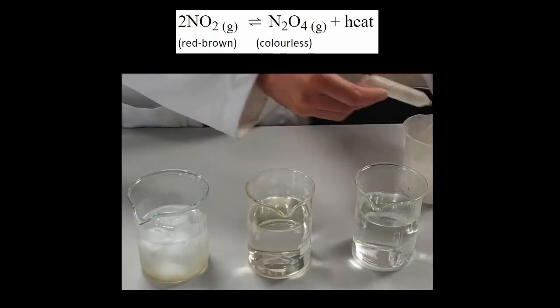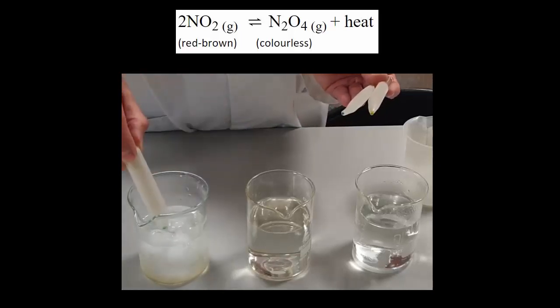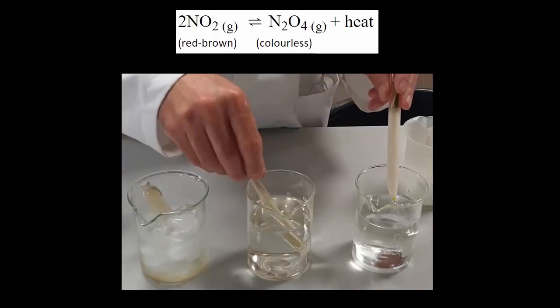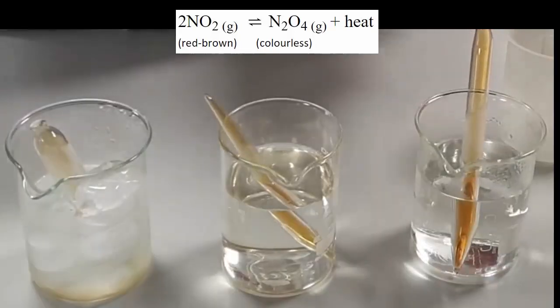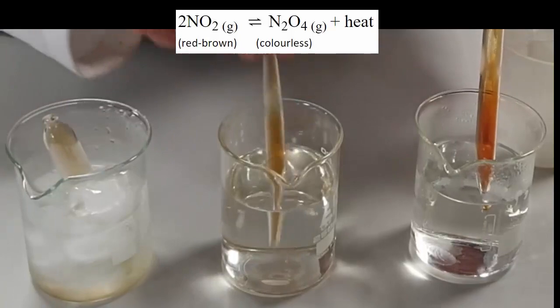So this is a reaction of a gas, nitrogen dioxide, that is a reddish color and dinitrogen tetraoxide that it's in equilibrium with. But it is an exothermic reaction going in this direction.